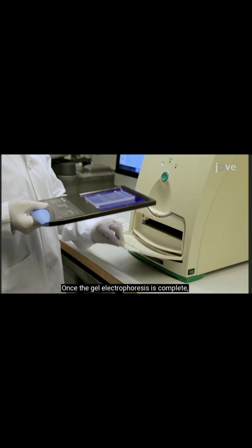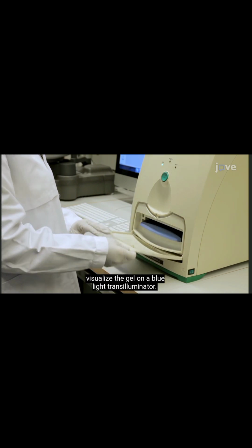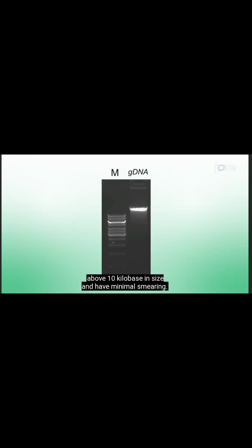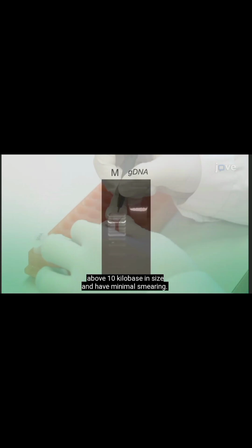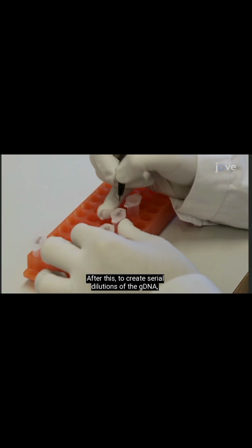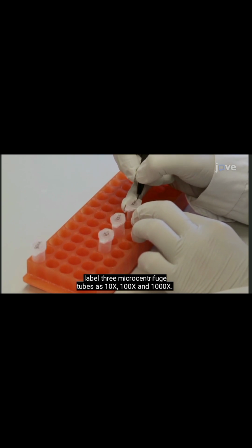Once the gel electrophoresis is complete, visualize the gel on a blue light transilluminator. The gDNA should appear as a thick band above 10 kilobase in size and have minimal smearing. After this, to create serial dilutions of the gDNA, label 3 microcentrifuge tubes as 10x, 100x, and 1000x.